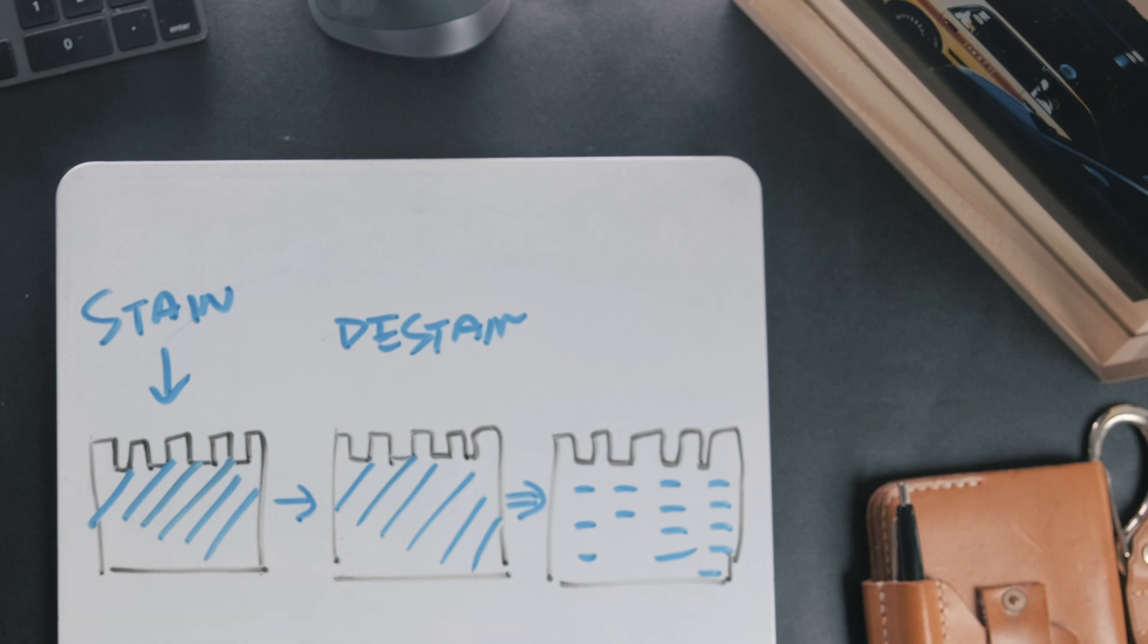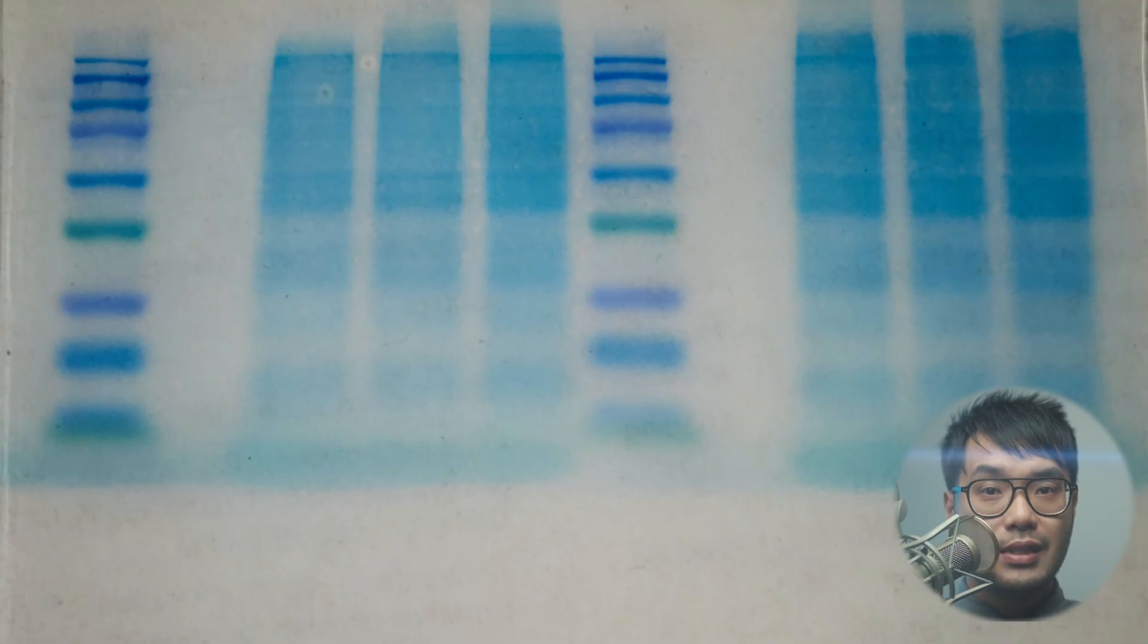After a few washes, the gel is ready for analysis. You should be able to see distinct bands representing different sized proteins across the lanes, with the color intensity of the staining indicative of the protein levels present. This is usually the first step of the analysis.